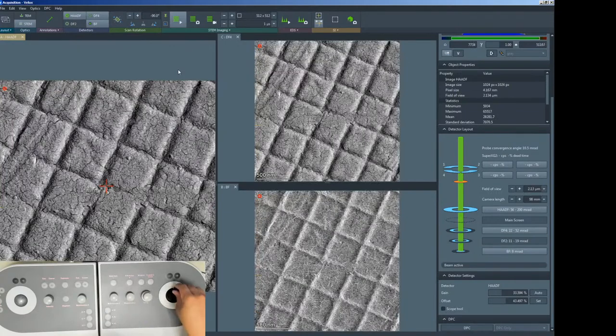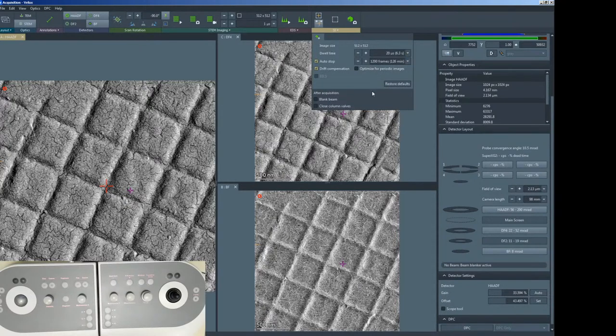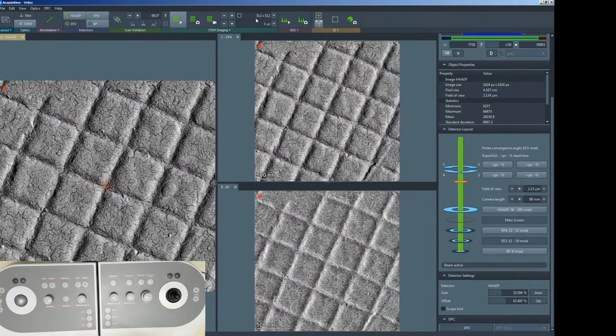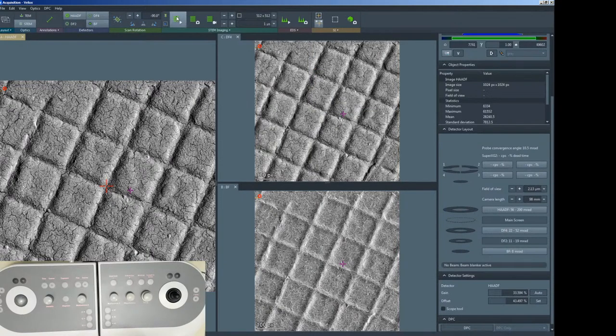So let's move around, find our region of interest, for example here, and we can stop searching. Now we are in this region. The EDS mapping is controlled here in this module under SI. If you click SI, it's going to open up another menu for you to set up the parameters. The image size is actually controlled by this. Usually you don't want to change your image size. I always use 512 by 512 because it's used by the searching. But of course, if you want, you can change to, for example, 1K by 1K. I always use 512 by 512.